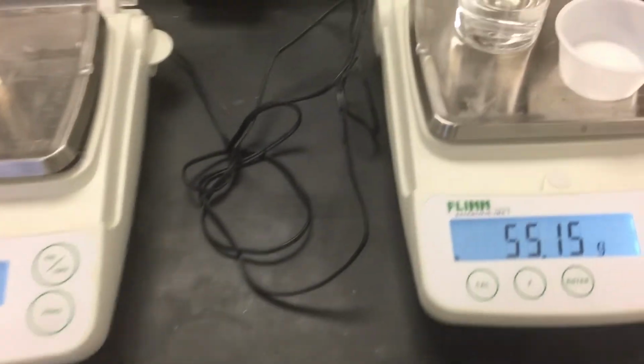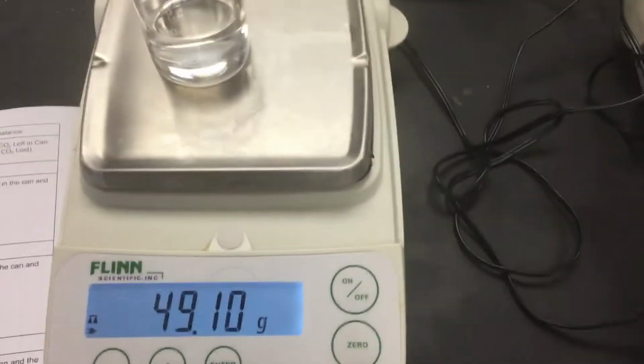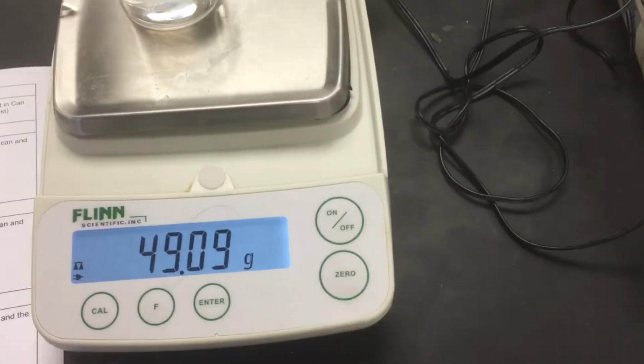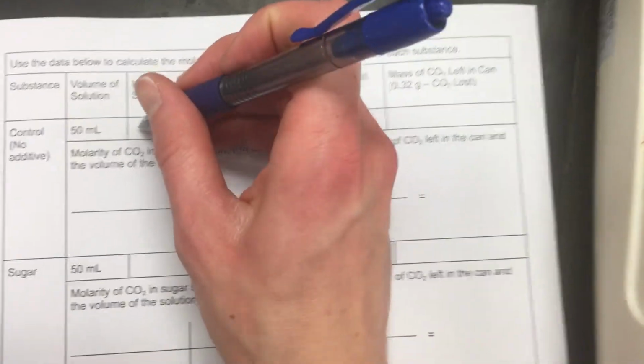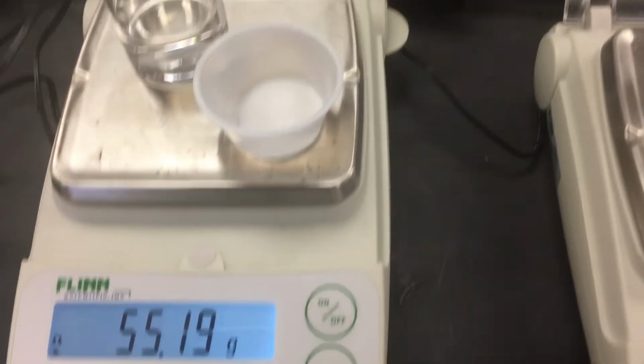So what I want you to do right now is just record the initial mass for each beaker. So this control beaker that's not going to have any salt or sugar, its mass, we're going to say that's about 49.09. So in the control for its mass, you would write 49.09. Okay? And then you would do the same thing for this one, the sugar.